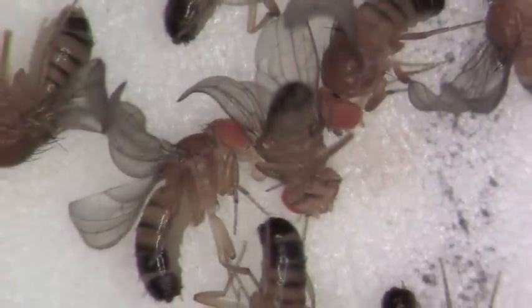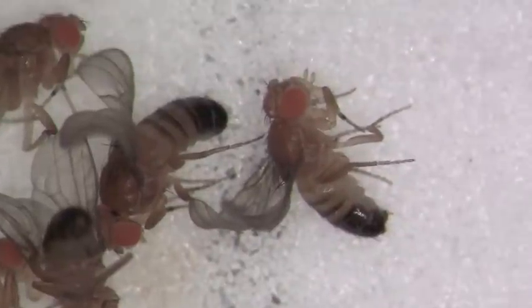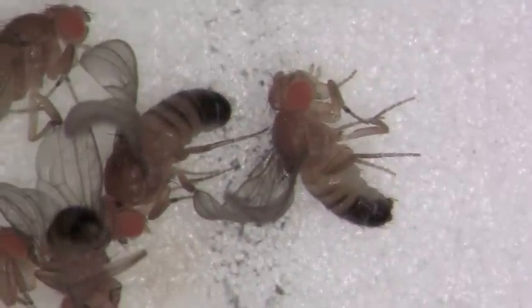The pigmentation in the posterior end of the males is significantly different from the females. It's more rounded and less pointy.